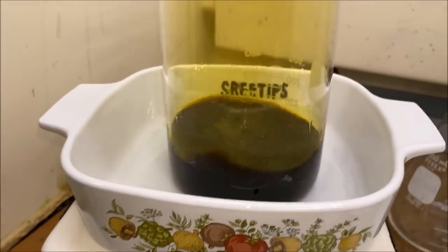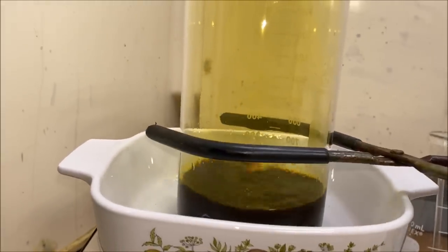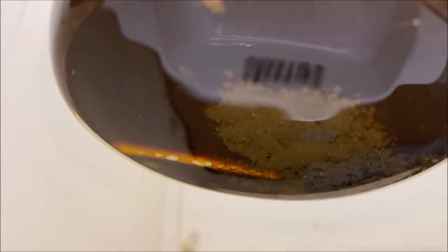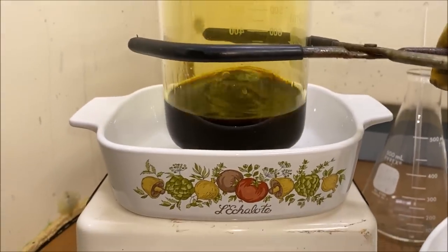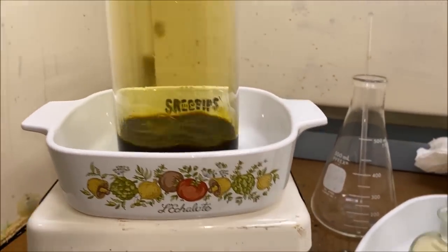I think I've got everything dissolved here. If you look underneath, well, I still got a little bit of solids left in there. Just have to keep going with the nitric acid until we get the rest of that to dissolve completely.